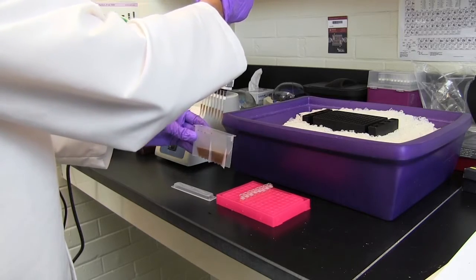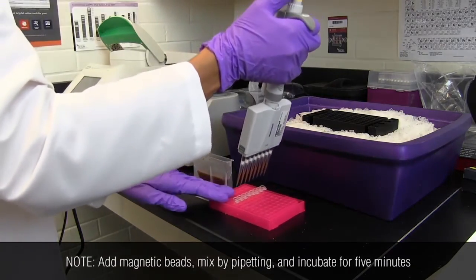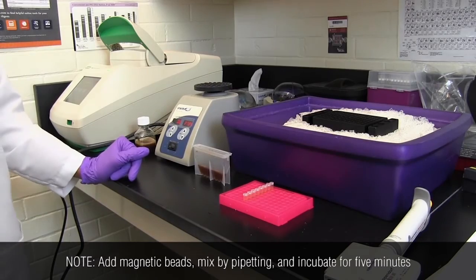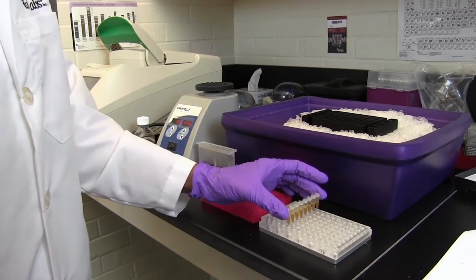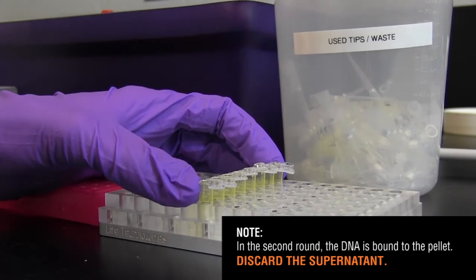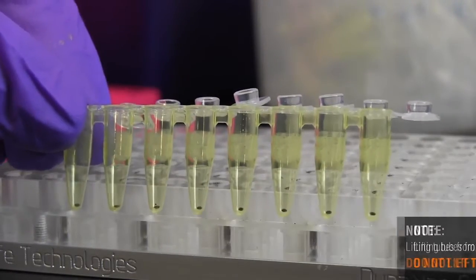For the second round of size selection, add new magnetic beads, incubate for 5 minutes, expose to a magnetic field, and remove the supernatant. Discard the supernatant, as the desired DNA is now bound to the beads in the pellet.